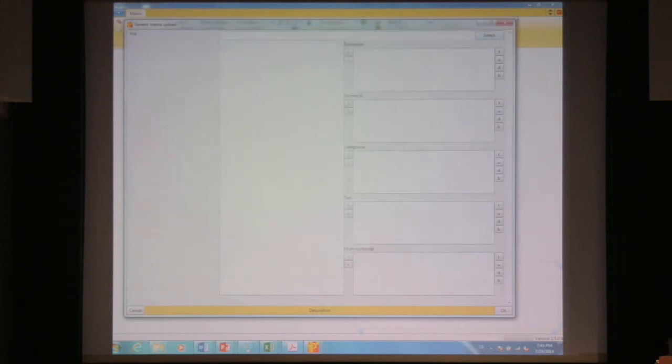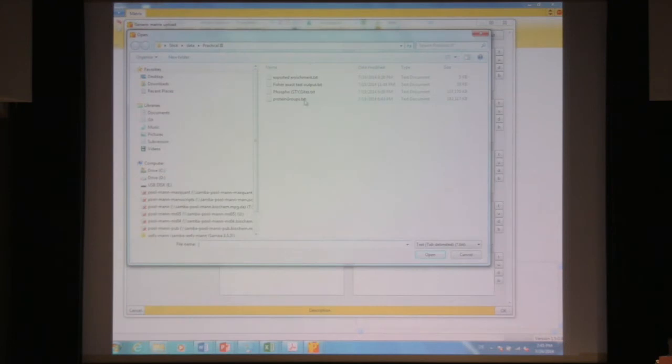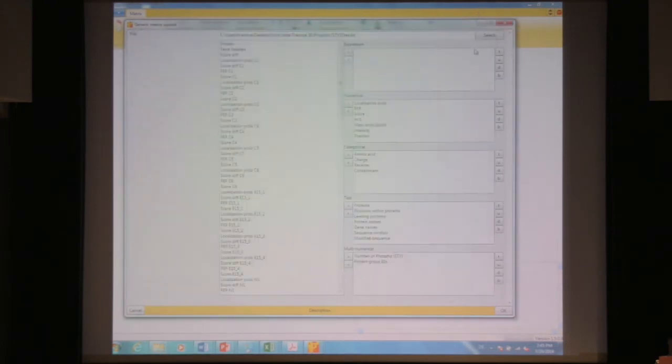It's not necessary, but if your data is processed with the newest MaxQuant, rather than being split like they are in this case, you can just select all of the intensity _1, 2, and 3 and drag them across in one go, because they don't contain these mod over base in between them. So they're grouped such that you can select them much more easily now. So anyway, go ahead and select these intensities here.